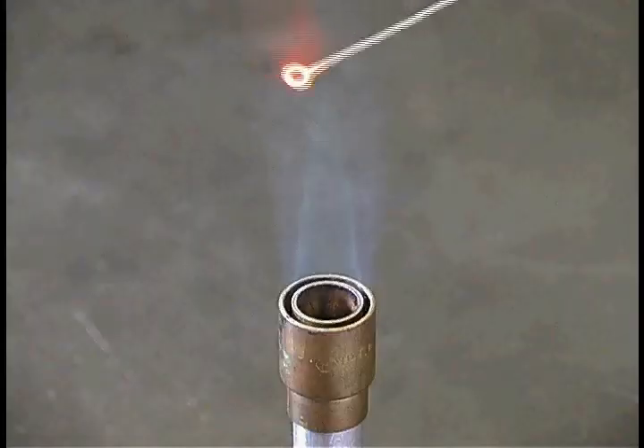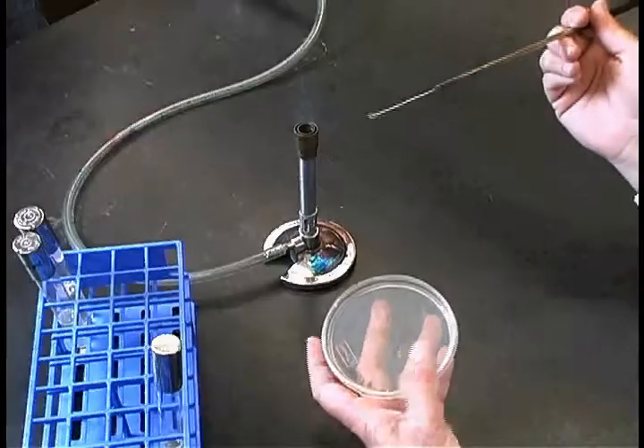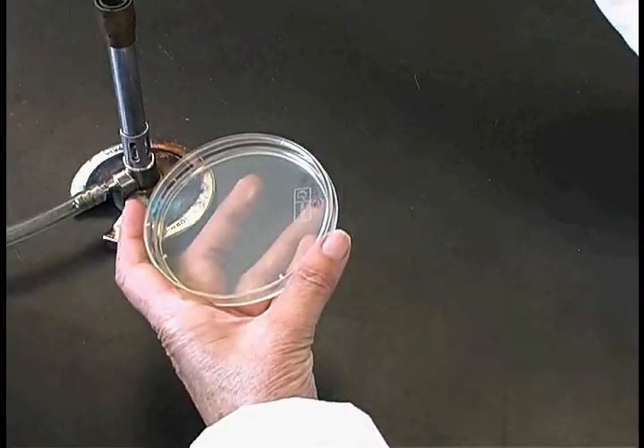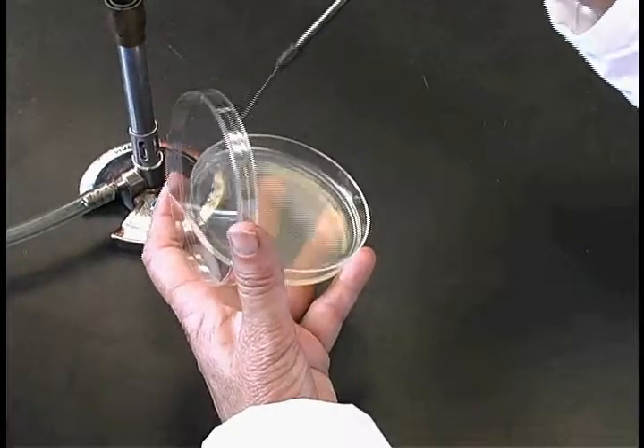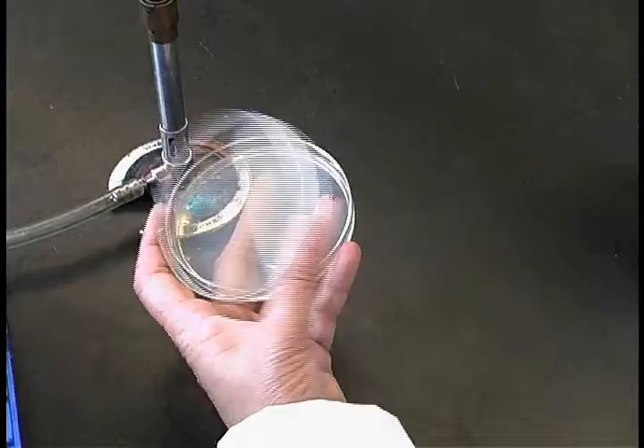Rotate the plate 90 degrees again and flame the loop, and once more streak over the last section of the plate, going back over the last streak section three or four times to spread the bacteria.